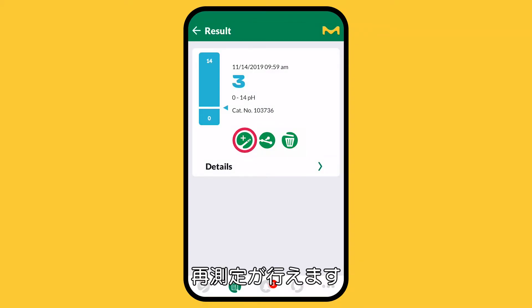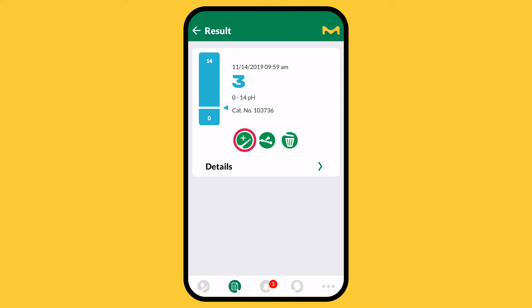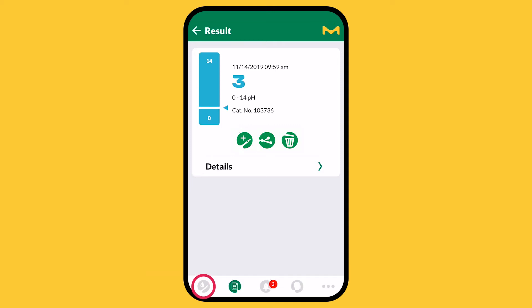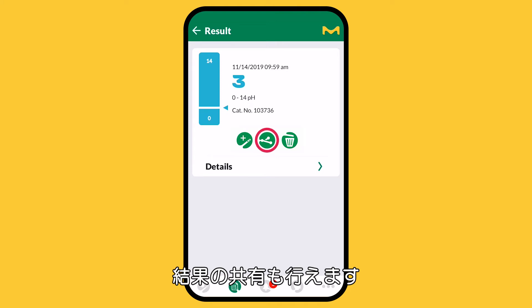You can repeat your measurement, select a different parameter, or share your result with a colleague.